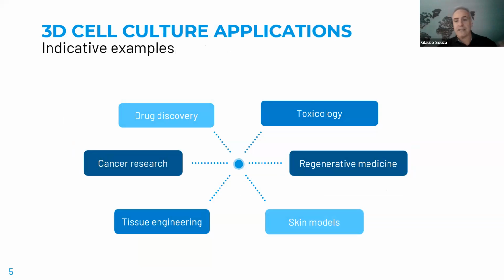Drug discovery, cancer, most 3D cell culture research started with cancer, tissue engineering, of course, if you're dealing with stem cells, toxicology. If you have drugs, you always want to test for toxicity.